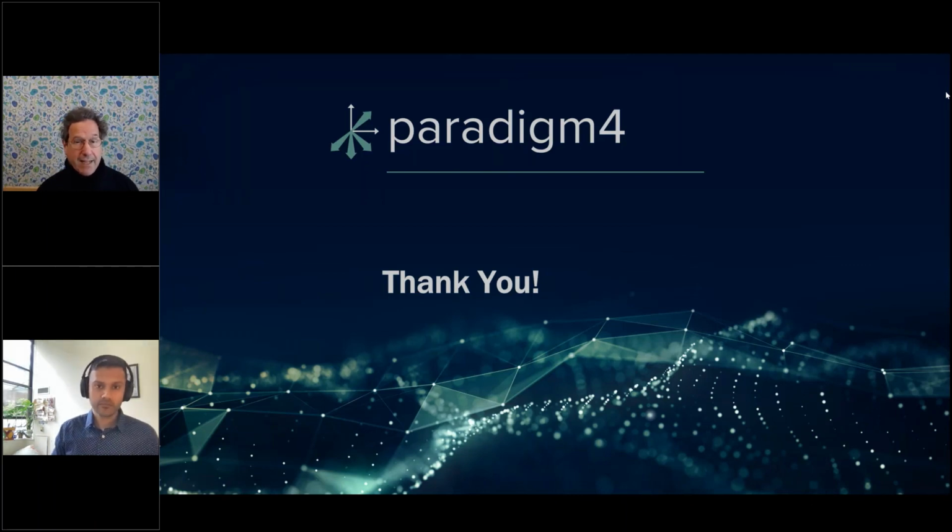So in that case, it was an HDF5 file directly into SciDB without opening it into memory. And so that gives you the potential to import data at scale, because that was parallelized.